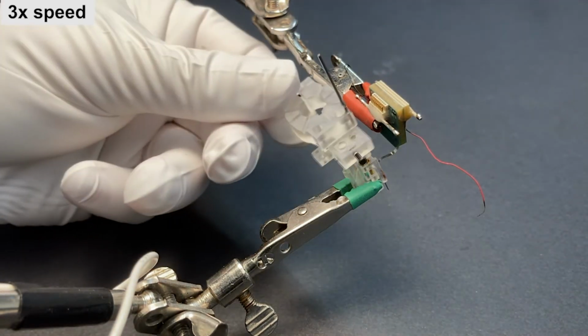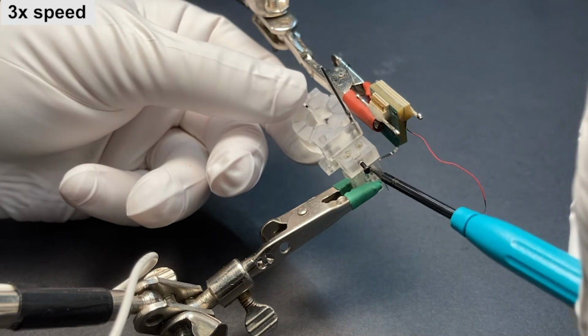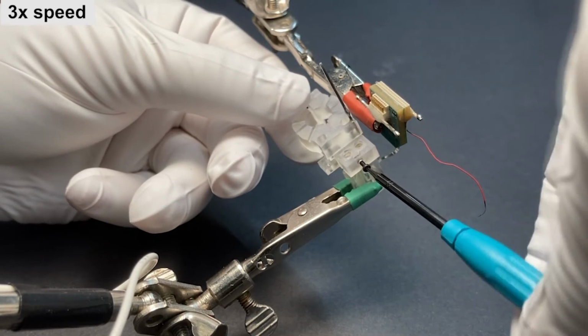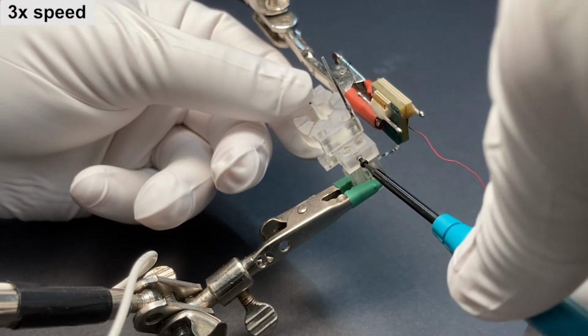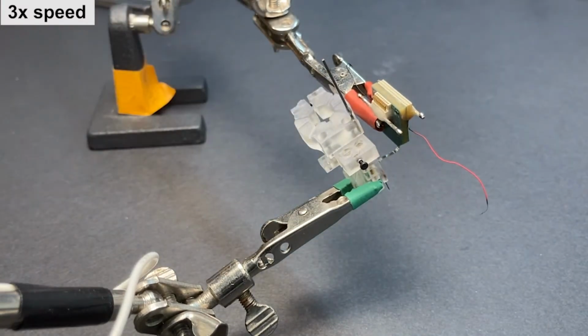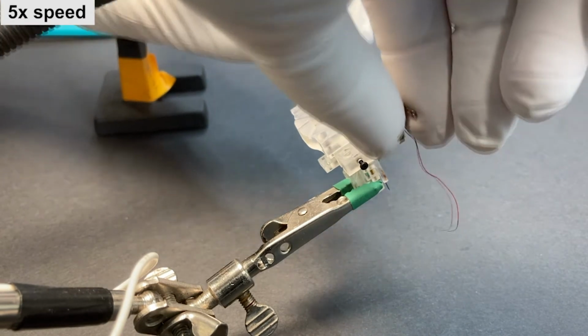And then we can attach this previously built stereotactic holder with the drive holder. And using this side screw, we secure the drive into this stereotactic holder. And then here we have the metal bar that we can use to solder the PCB to this metal bar.